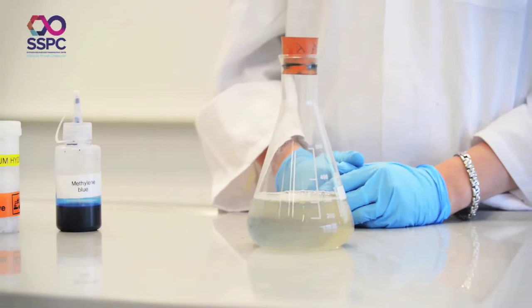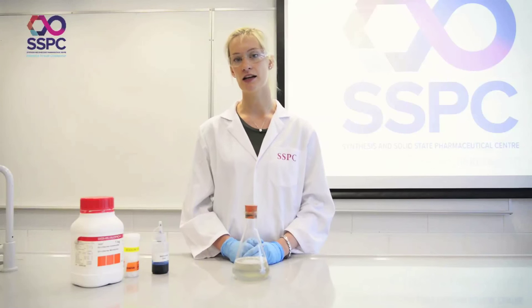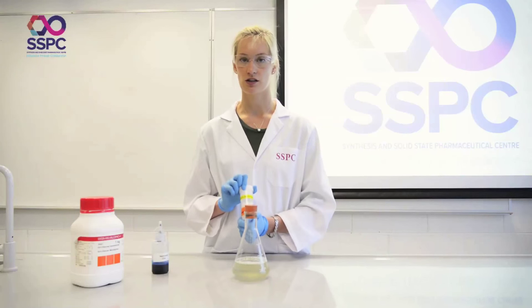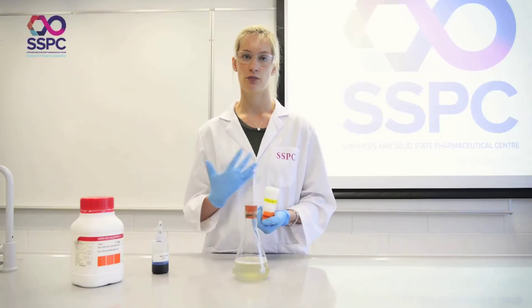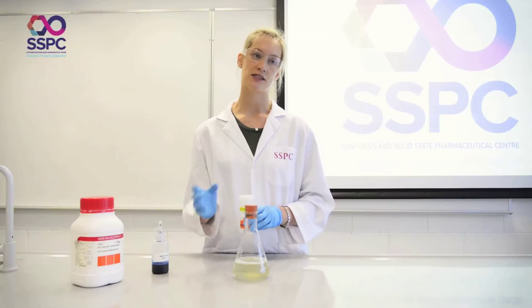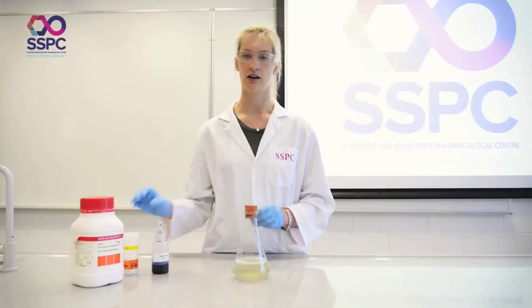The safety considerations for this experiment are primarily to do with the sodium hydroxide. Ensure you're wearing appropriate safety equipment and gloves when handling it, and always add it to an excess of water — not the other way around.